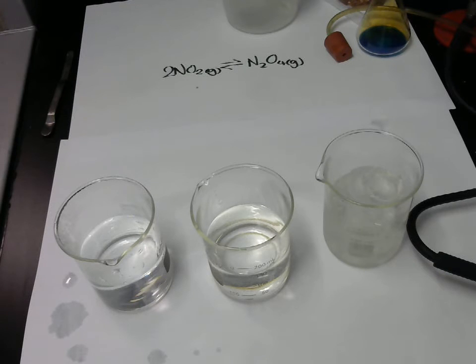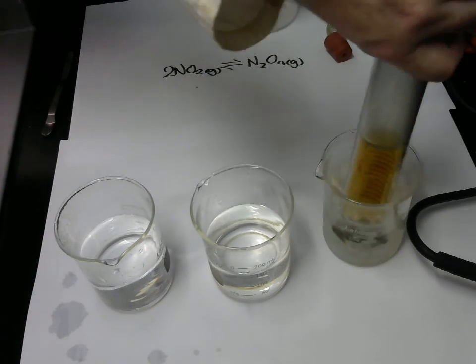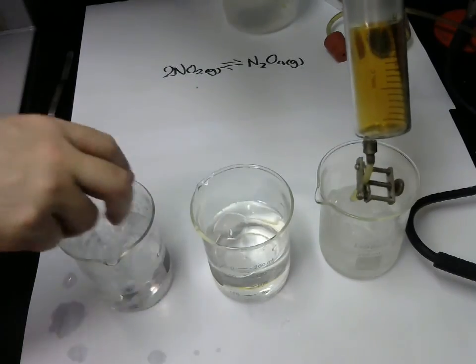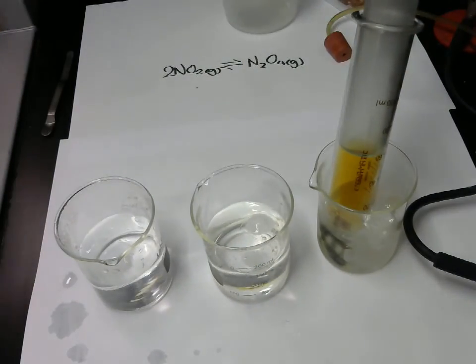Right, not a lot lighter because our cold water on this not so warm day is probably only about 12 to 13 degrees Celsius. So probably only change the temperature by about 12 degrees. It's not a large amount. I'm going to leave that in there for just a little while to see what happens. It's ice out. That's going to make the pressure change as well, that's okay.